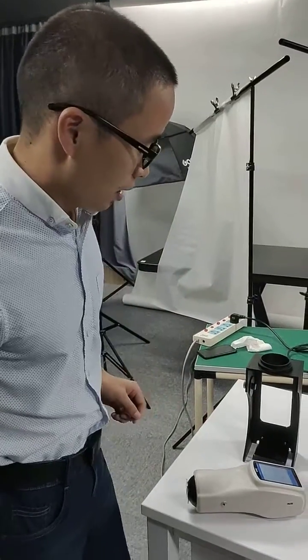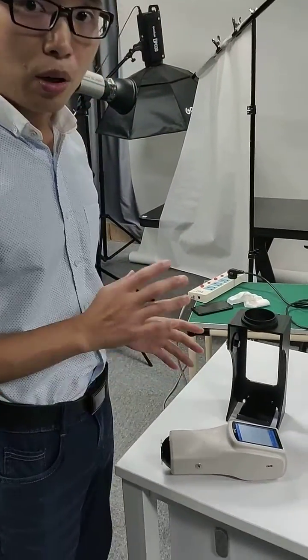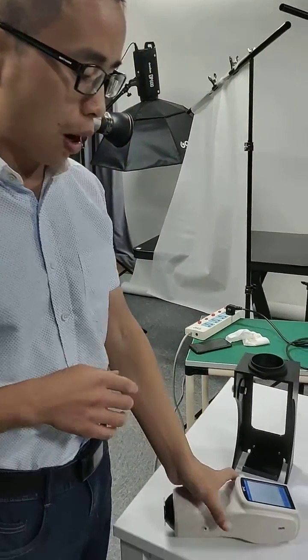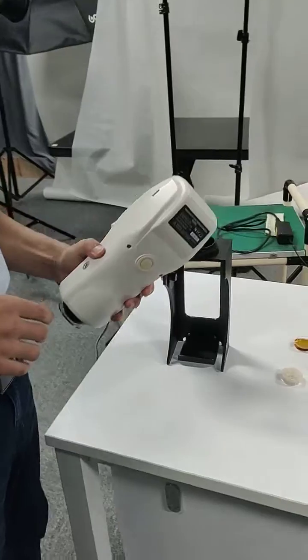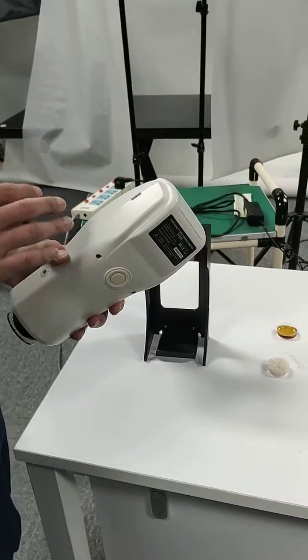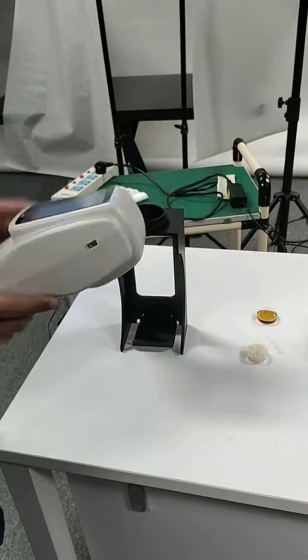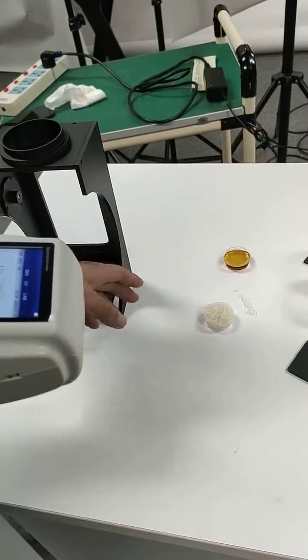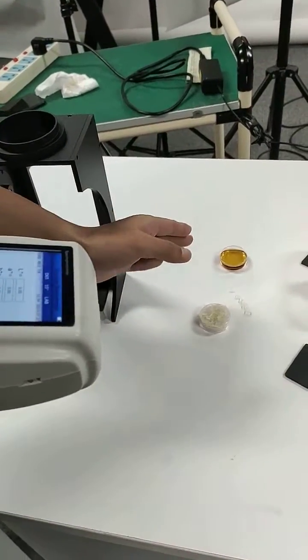Hello. Here I'm going to show you how to use our NS-Series spectrophotometer to measure the color of powder and liquids.